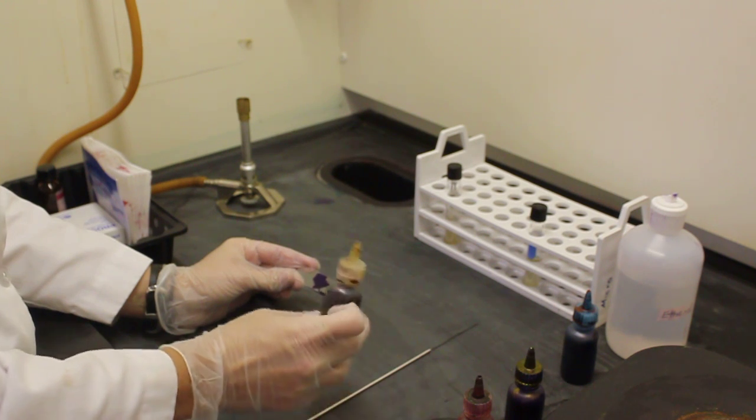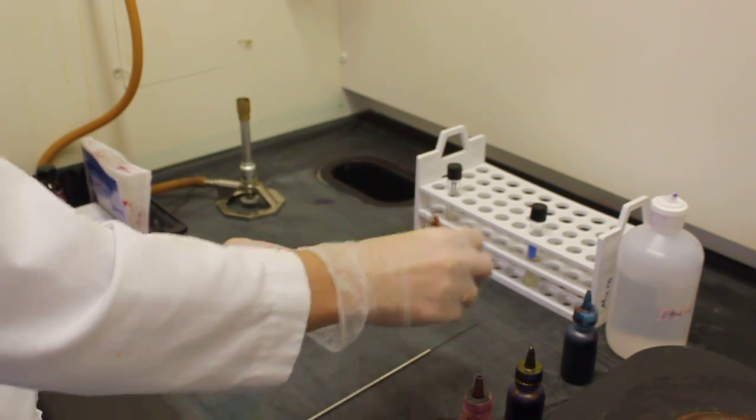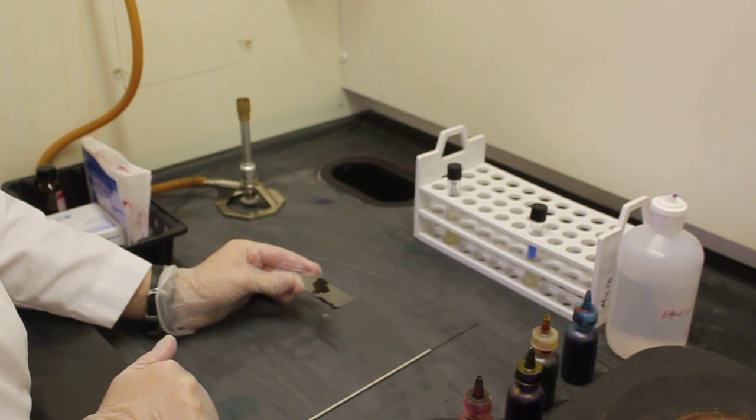I'm now going to apply my mordant iodine. Applying the iodine makes the gram positive cells, which have a thicker layer of peptidoglycan, hold on to that primary stain. The iodine must sit on your slide for one minute as well.